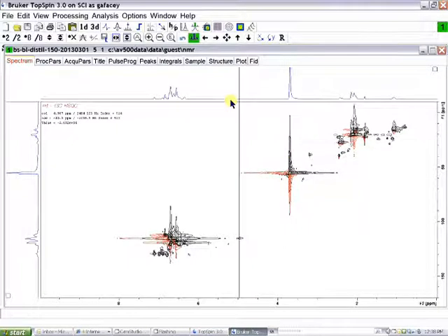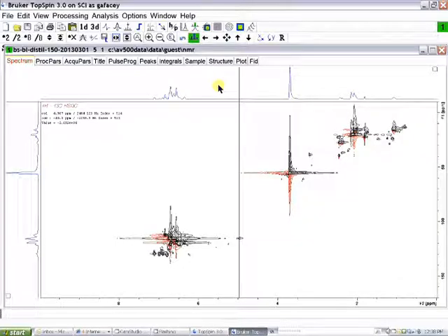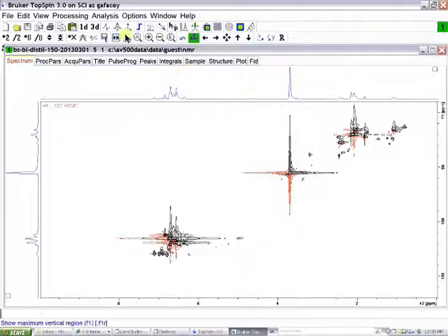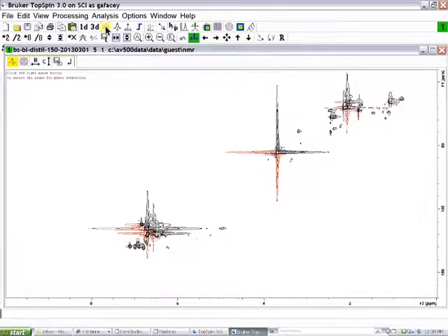To phase an NMR spectrum like this, or to phase a NOSY spectrum, which is another type of phase-sensitive input, we click first on the phasing icon on the top menu bar with the left-hand mouse button, and what we want to do is select three rows for phasing.